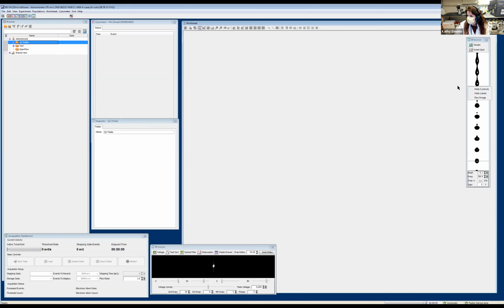So that's the gap that we see. And then we also see drop one. That is this thin gray line right here, and that's the difference between the top of the image and the center of this detached drop right here, okay?